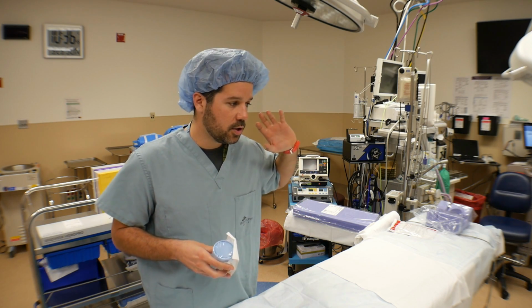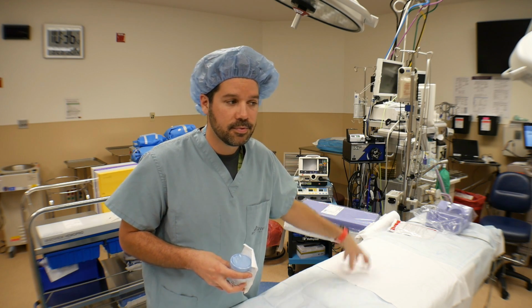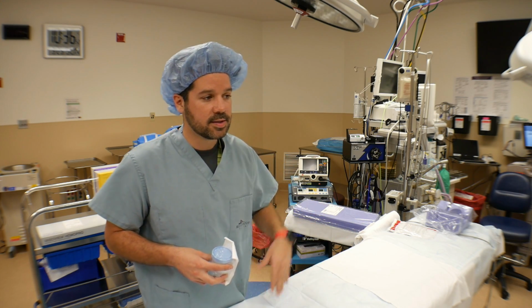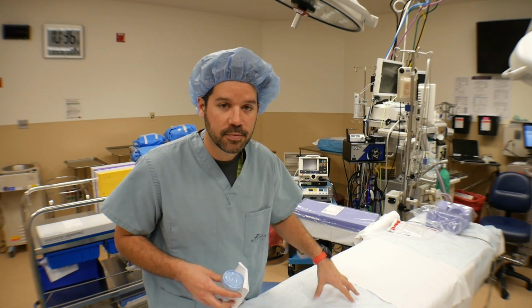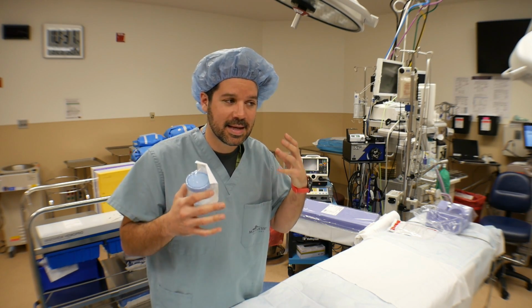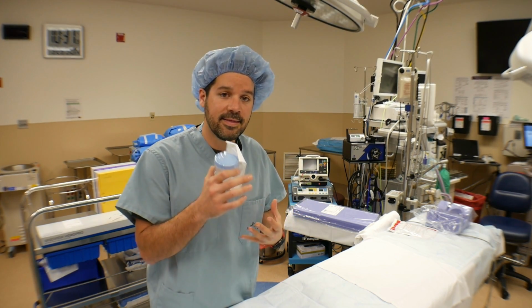The surgeon will tell you, this is a left breast tissue biopsy, or this is a right upper lobe wedge resection. They will tell you the exact anatomical location of this tissue specimen they are giving you.